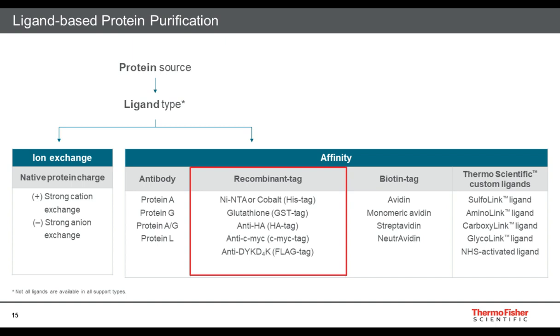So moving on, almost everyone prefers the speed and efficiency of affinity purification over classical chromatography. Many of these ligands, especially those to purify tagged recombinant proteins, are available on both chromatography resins as well as magnetic beads. Classical resins, such as cation and anion exchange resins, hydrophobic interaction resins, etc., still have their place when purifying endogenous proteins, which have no overexpression tag, or as a polishing step after affinity chromatography to maximize purity by removing small trace levels of contaminants.